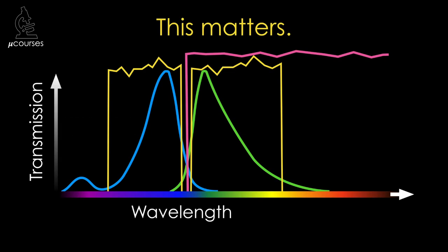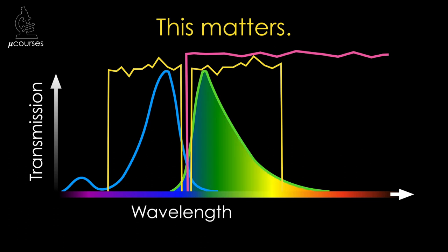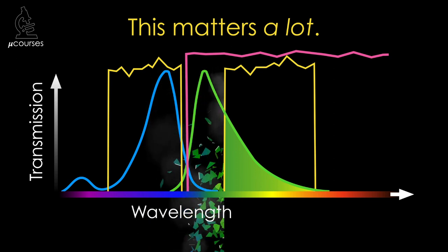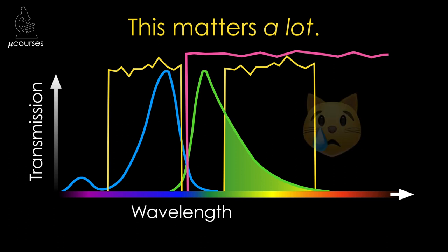Carefully choosing a filter set is so important. If you use the correct filter set for your fluorophore, you'll look into the microscope and see green. But if your filter set has a different emission filter, you'll still see green — assuming your sample is bright enough — but you won't know that you've blocked out the vast majority of photons emitted from your sample. And if your sample is on the dim side, you might see nothing at all.